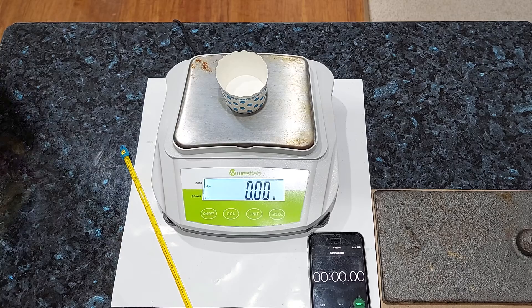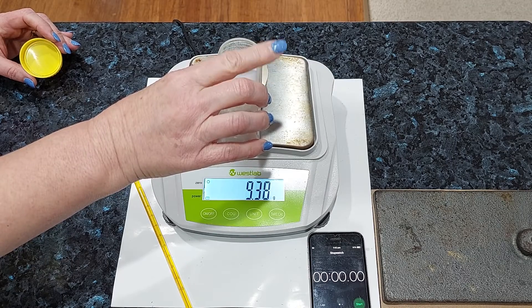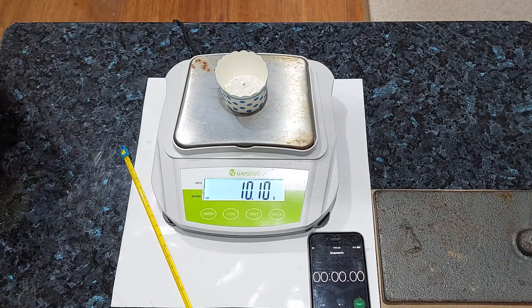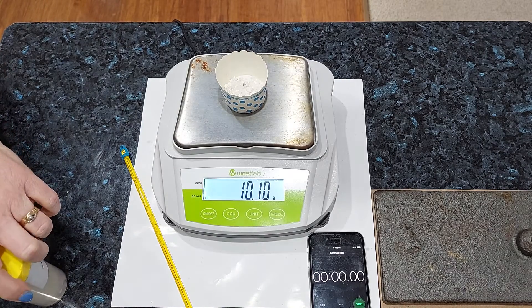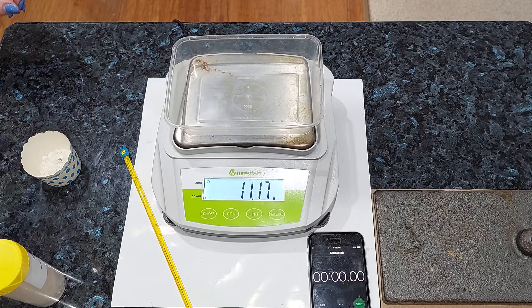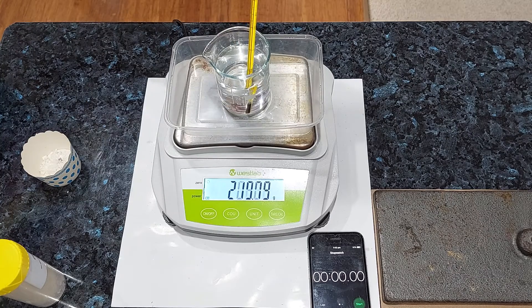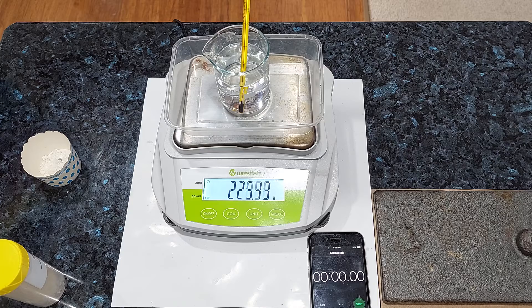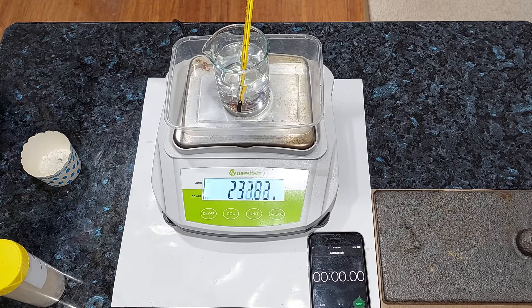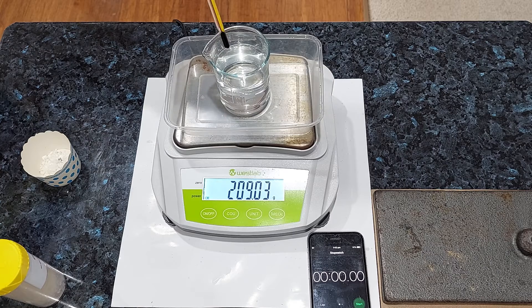We're going to use 10 grams of marble chips, or thereabouts. Let's measure that out. That looks pretty good — 10.10 grams to add to our starting mass. Let's get our balance protector on and our beaker of acid. The first thing we're going to do is measure the temperature of the acid. We'll put the thermometer into the acid and wait for it to stabilize. This acid is around 19 degrees Celsius, so note that down.